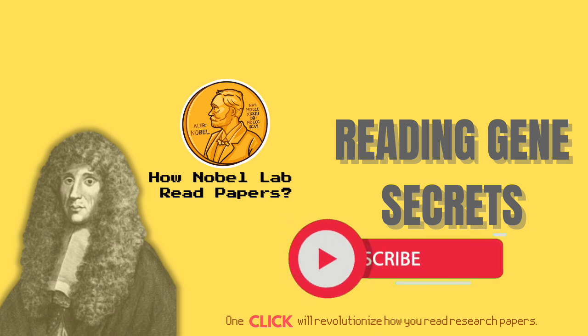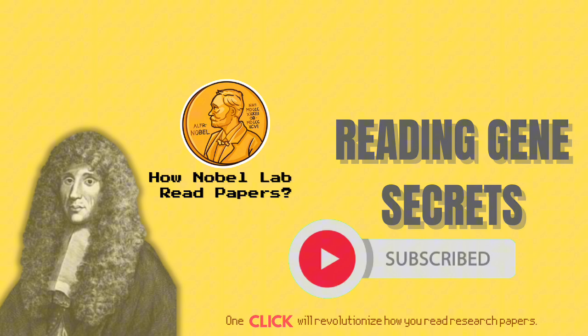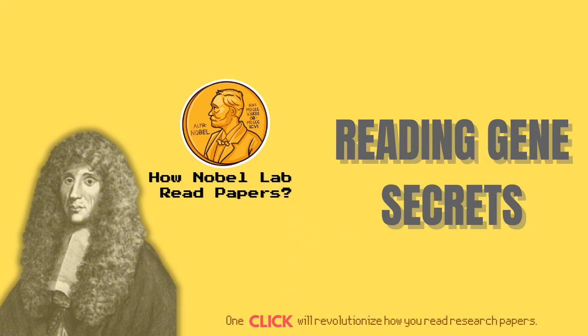The parallel sequencing. What did that look like? Exactly. These adapter ligated fragments get loaded onto a next-generation sequencer. Back then, it was the Illumina genome analyzer, state-of-the-art. And this thing just churns out reads. Millions of them. Short sequences representing the ends of those fragments. The paper reported like 41 to 52 million mapped reads per sample. Just an incredible amount of data for the time.